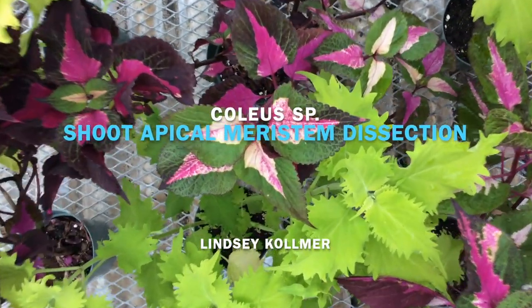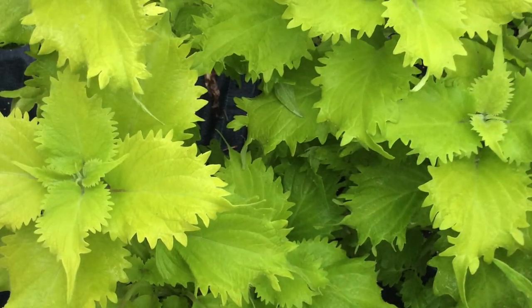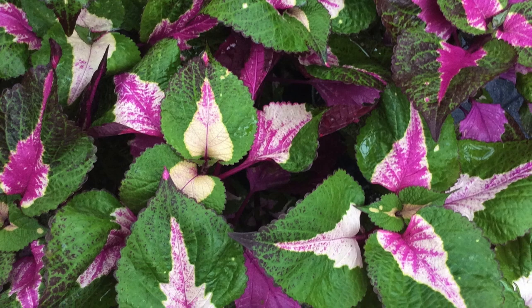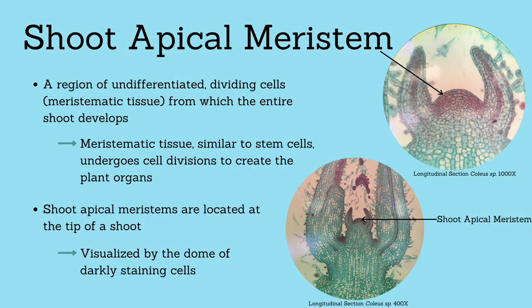Today I am going to be dissecting a shoot apical meristem of a coleus plant. Coleus plants come in green and purple varieties and I will use a more purple plant for this dissection. The shoot apical meristem is a region of undifferentiated dividing cells from which the entire shoot, including new plant organs, develop.